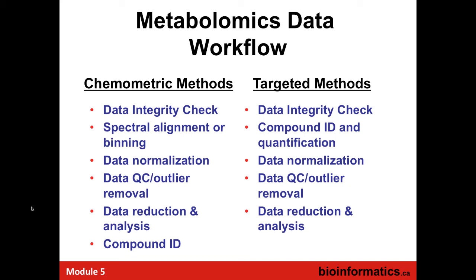For targeted methods, we'll do some quick data integrity checks at the very beginning. Then you do the compound ID and quantification. Then you do the data normalization, QC, and then you do the data reduction and analysis. So there is a difference in order, and basically one does identification at the beginning, the other does identification at the end.